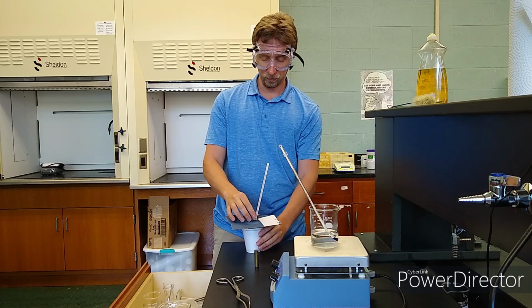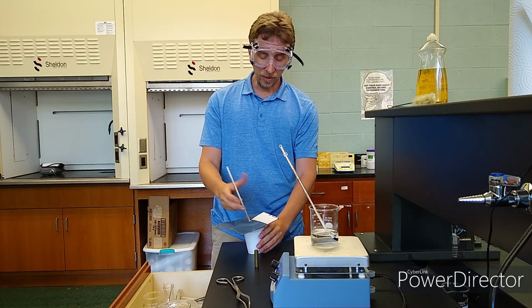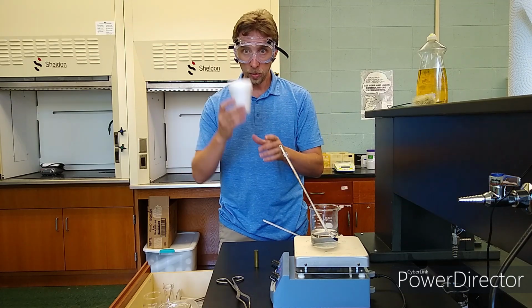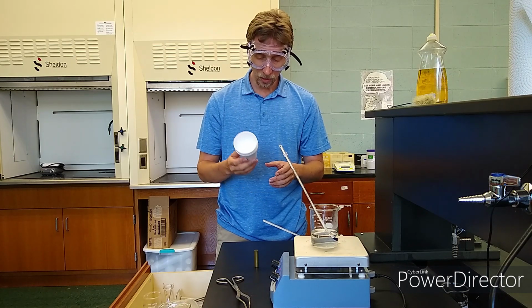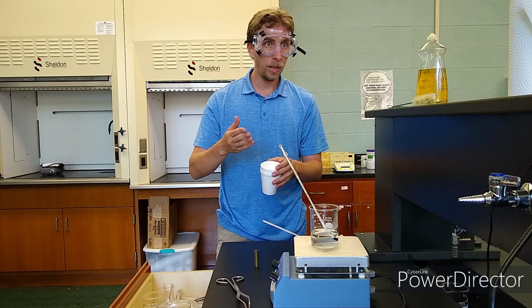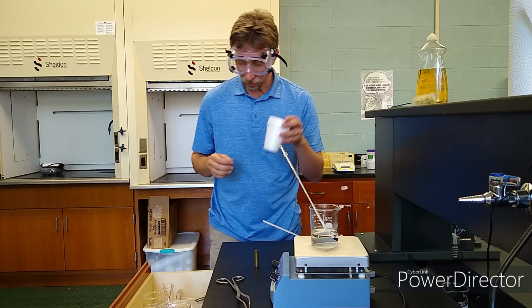But it's not standing up. Why isn't it standing up? Well, it's obviously top heavy, and what am I going to do in order to make it usable? We need to put water in the calorimeter. And like we showed in the classroom, in the example problem that we went over on the board, how many grams of water did they use? 1,000 grams. I'm not going to use that much water.